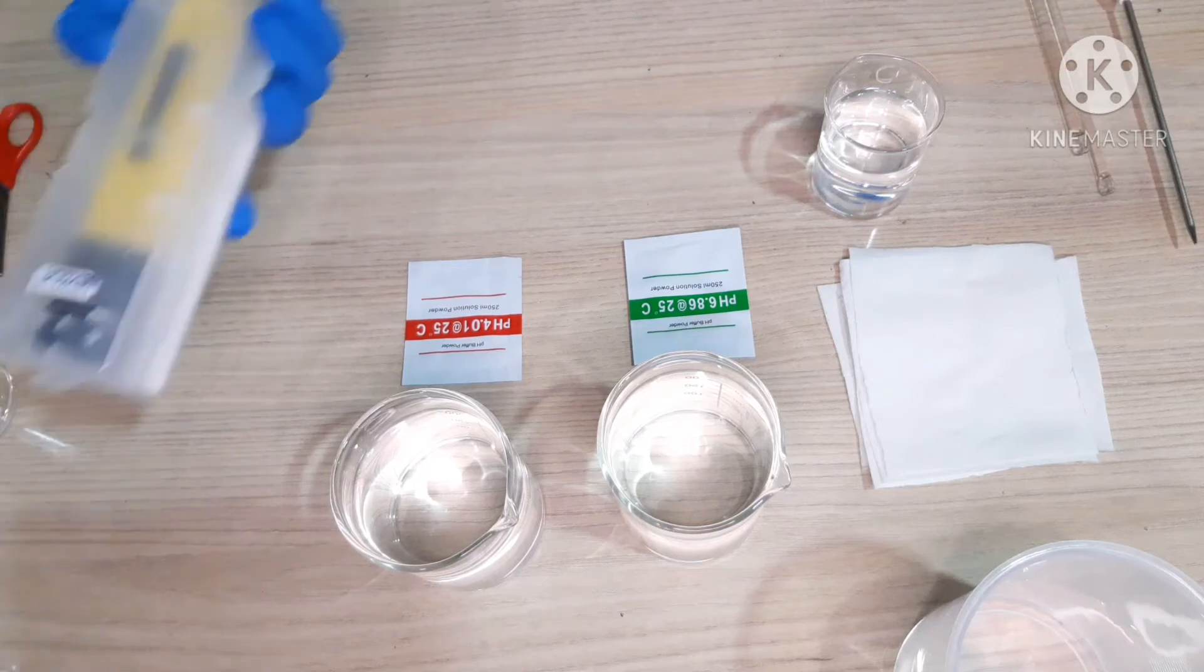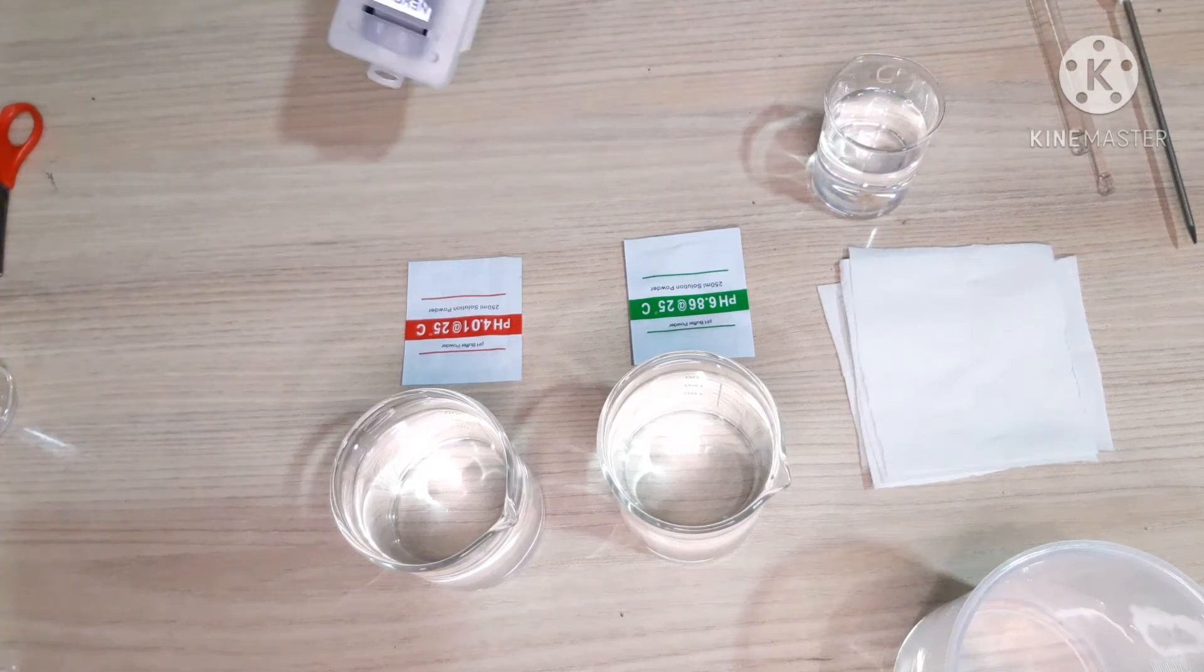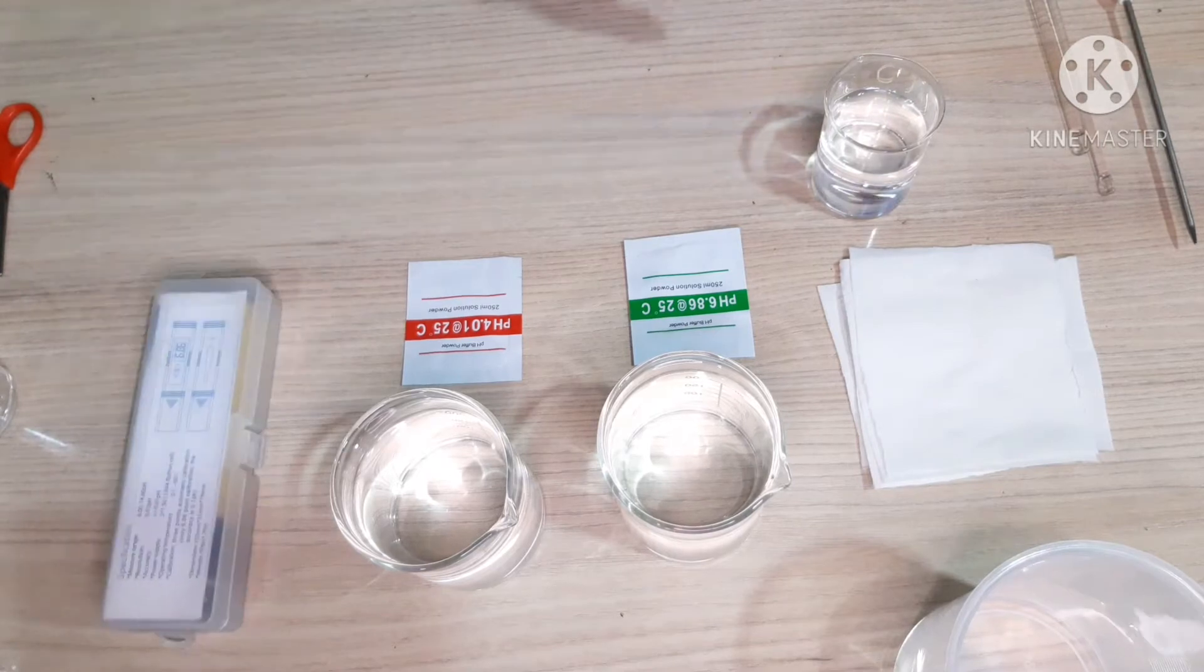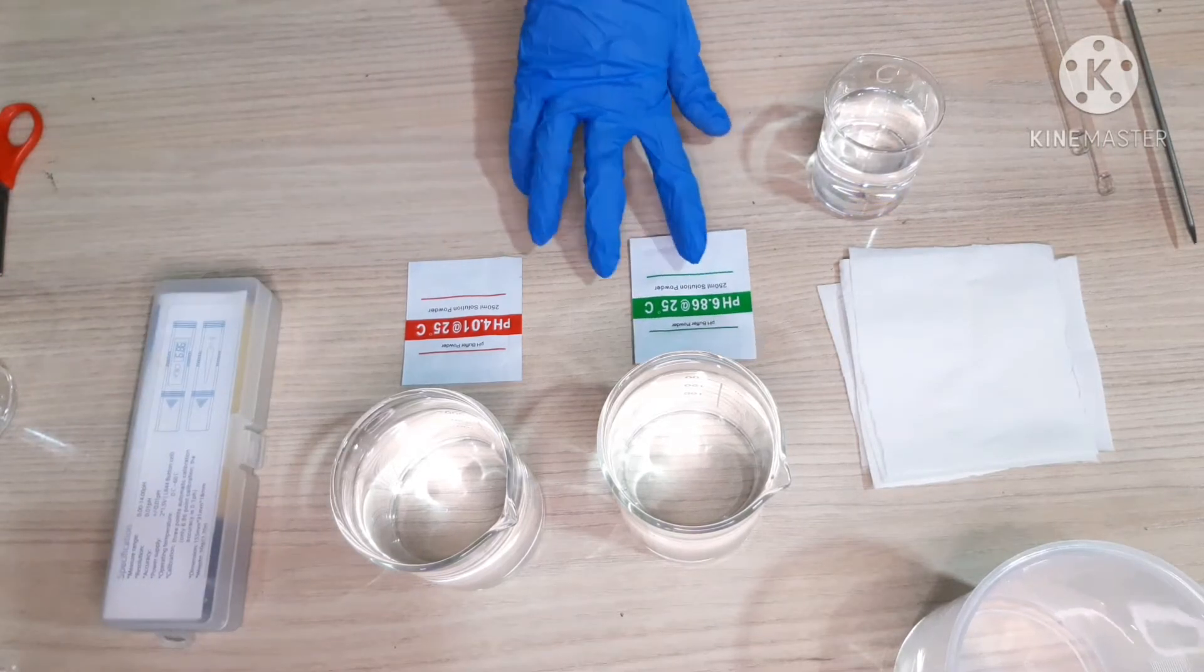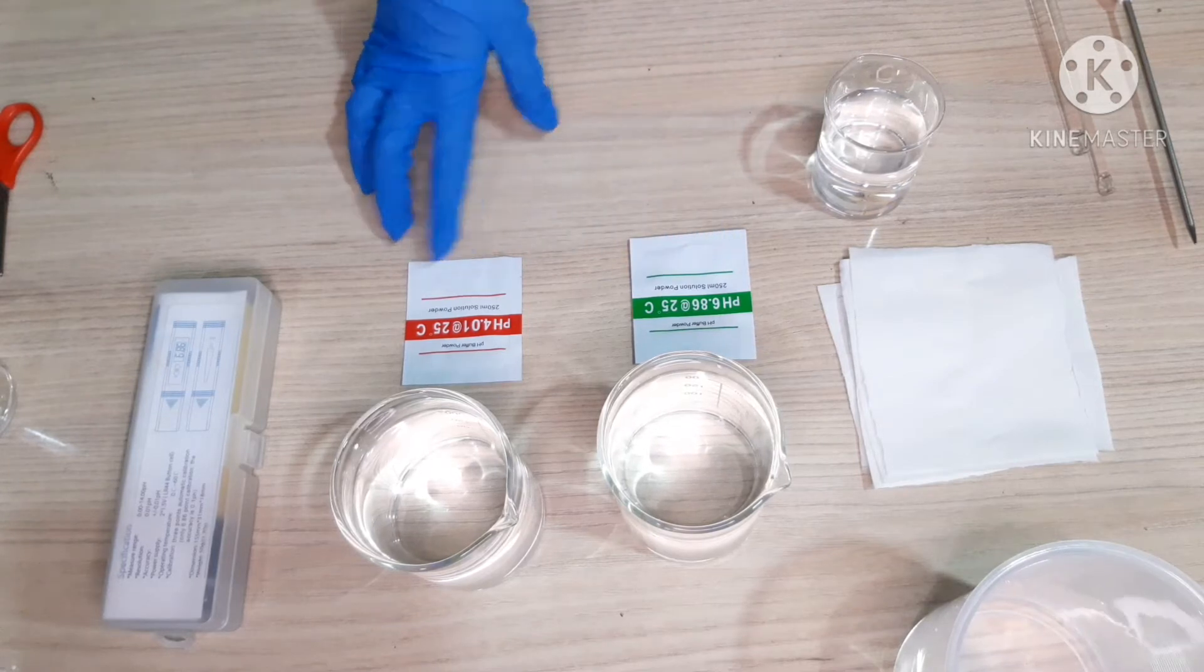We will be calibrating the pH meter today. I have been using it for some time now. I have got these buffer powders from Amazon, one pH 6.86 and another one is 4.01.